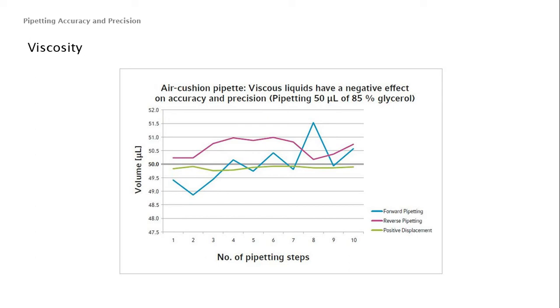Other lab technicians do the trick of cutting the tip of the pipette tip, so you will have a bigger hole on the tip, allowing a larger amount of volume to go into the pipette tip.